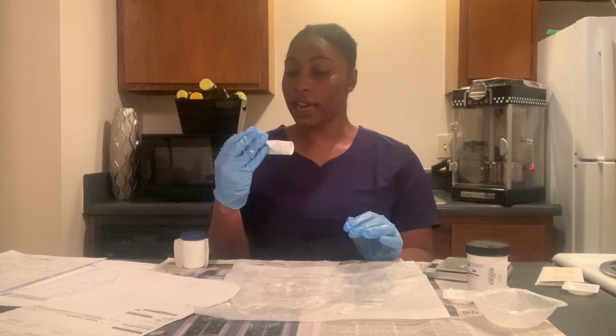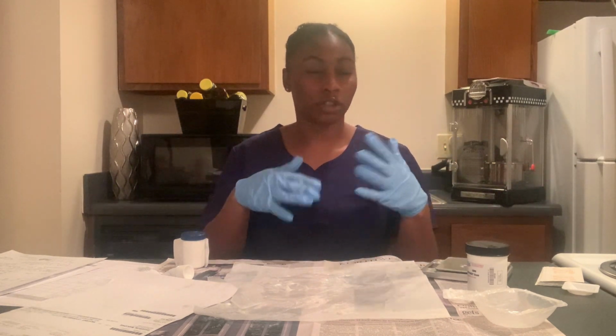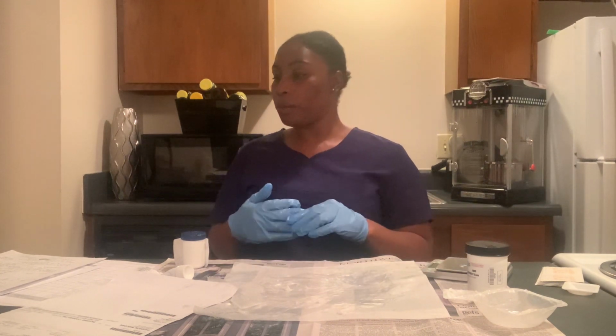Then you'll have to write down the dosage form for both the ointment base and nitroglycerin, and I'll show you guys exactly what a compounding record looks like.